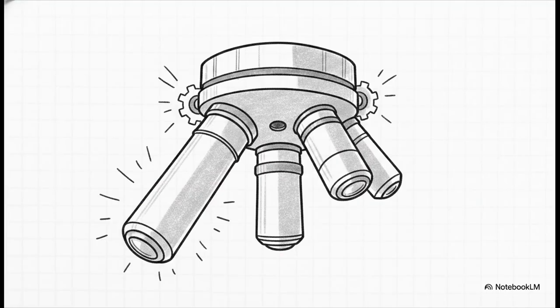And this brilliantly illustrates exactly how standard clinical compound microscopes are built. You literally just swap out different objective lenses on a revolving nose piece to get varying levels of detail. You've got your scanning lens at 4x for a nice wide view, the low power at 10x, the high dry at 40x for unstained targets, and finally the heavy hitter, the oil immersion lens at 100x. Pair that 100x with a 10x ocular and you max out optical magnification at 1000x. But, as you'll see in a second, 1000x magnification is utterly useless if the image is blurry.